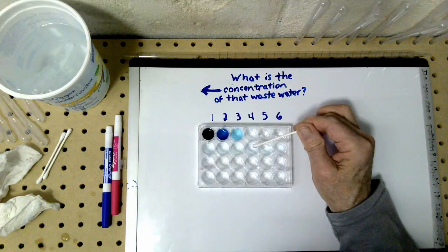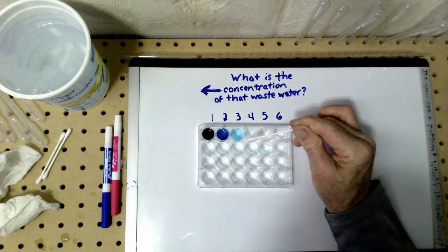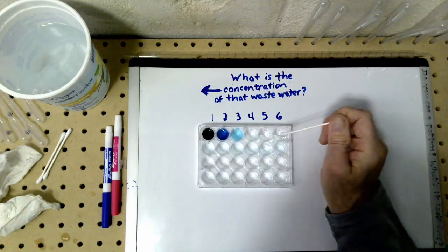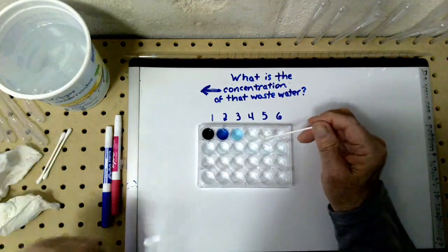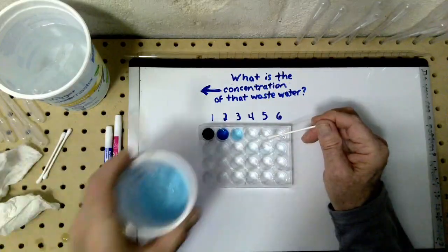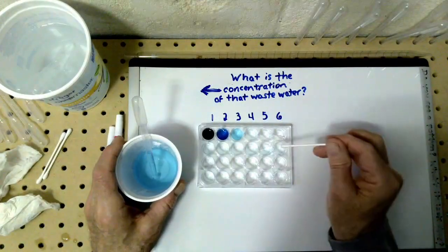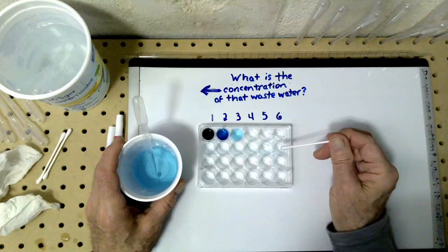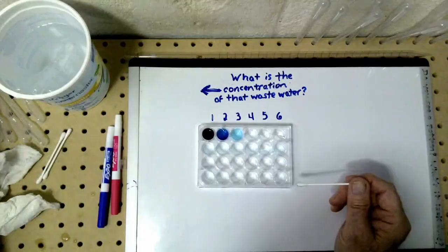Now, it's not going to be perfect because, between each of these, there would be even fractions of dilutions between there. I'm going to go with this one. Before, when I showed you this, it's so deep. Here, these are all the same depth, so we're looking through the same thickness. This is so thick that's why it looks more blue.